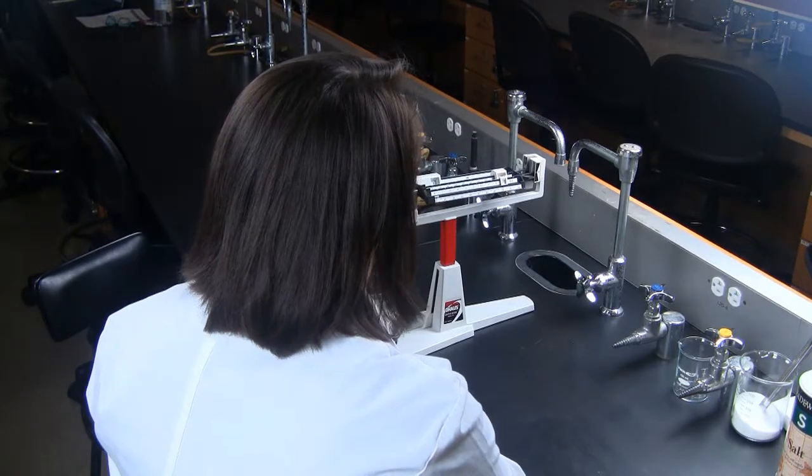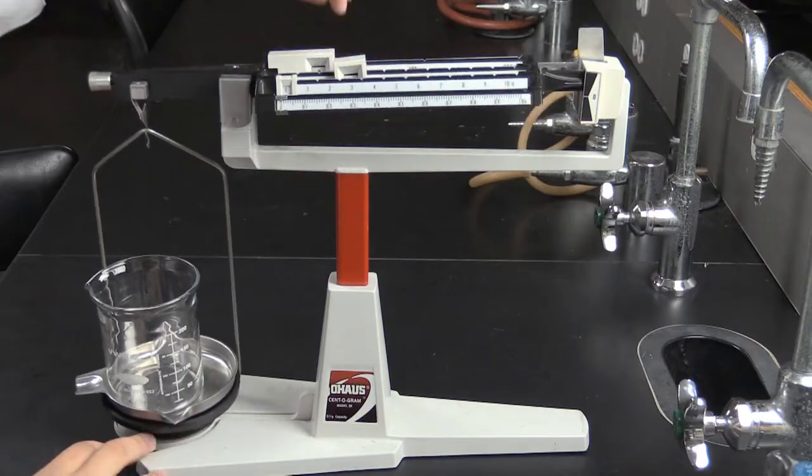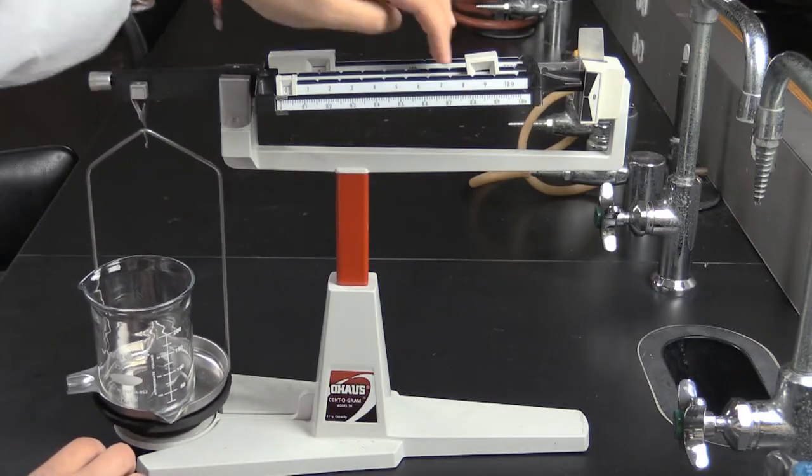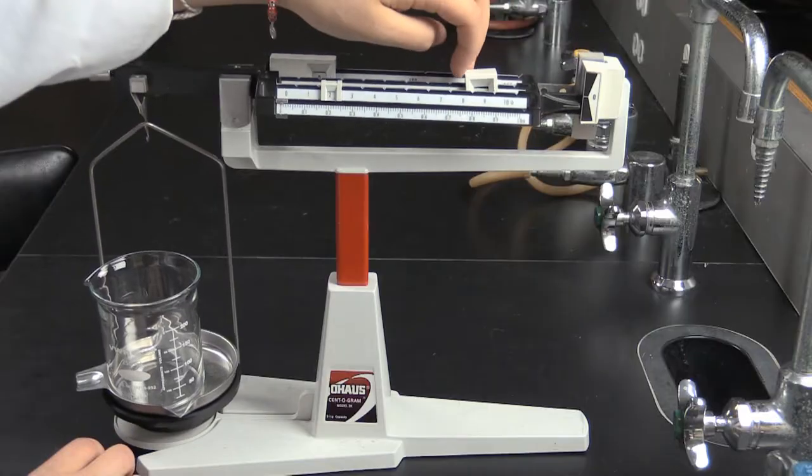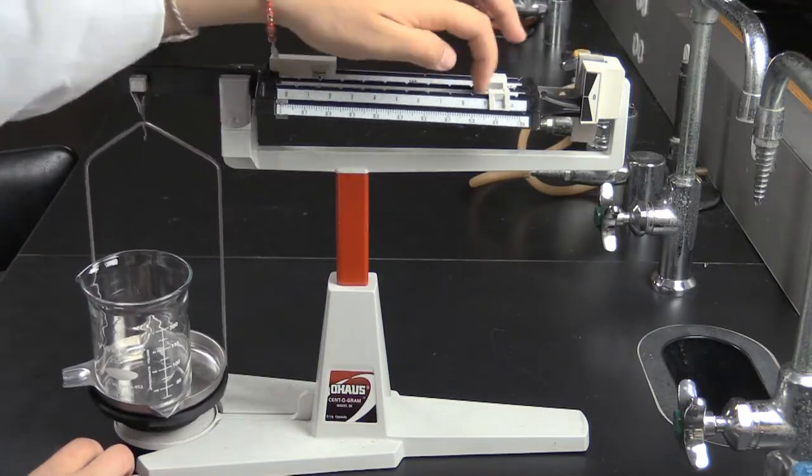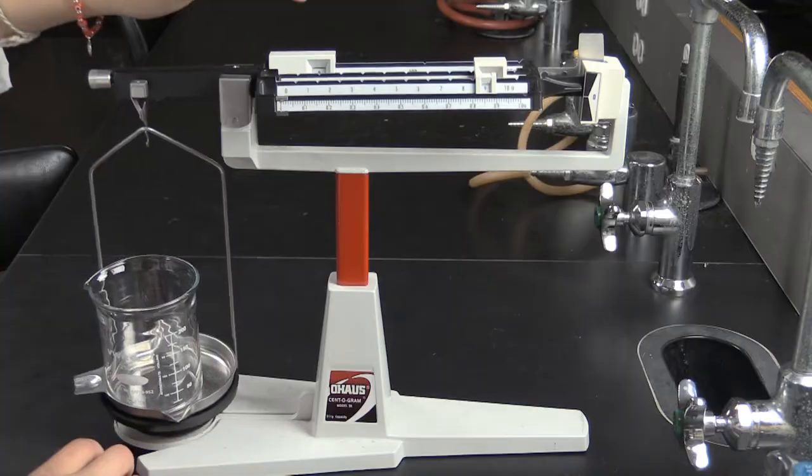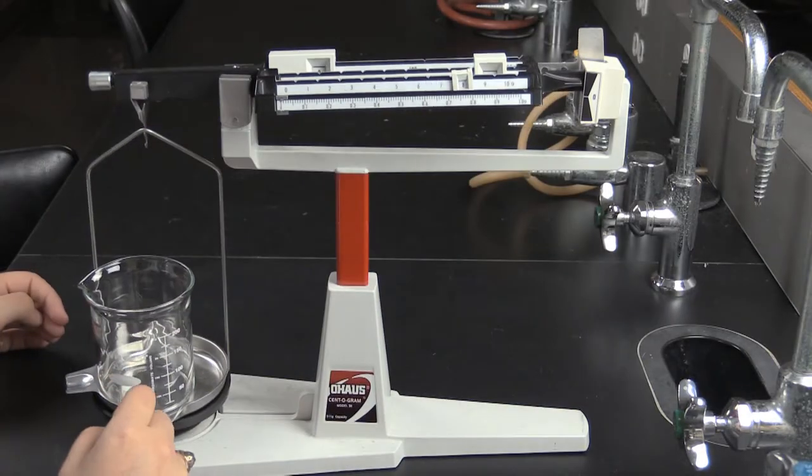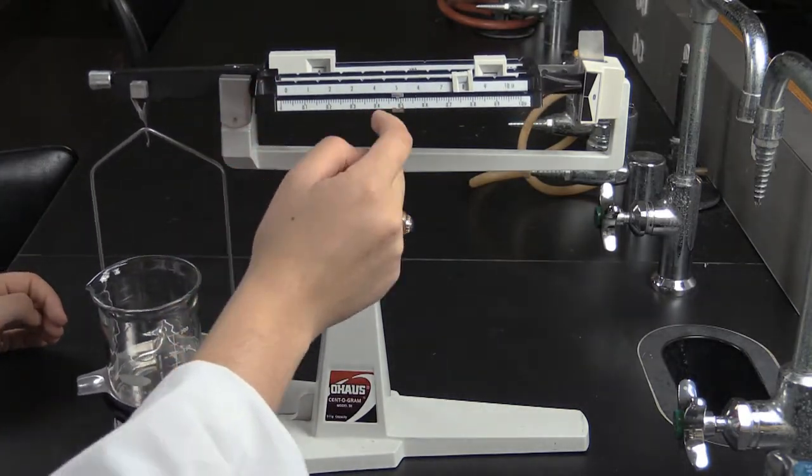Now slide the sliders back and forth until you re-establish balance. Start with the largest place value. In this case, it is the hundreds place. Move the slider until the beam goes out of balance in the opposite direction. Then move it back one slot.